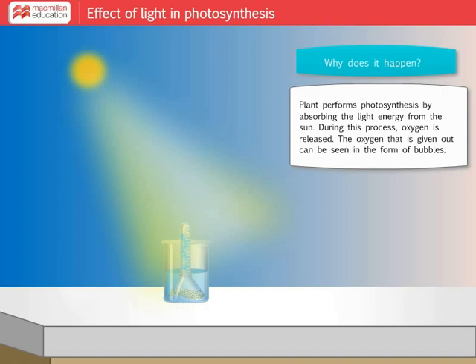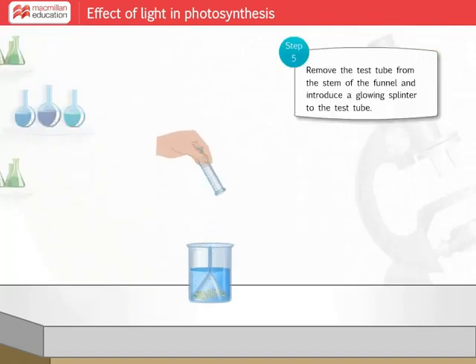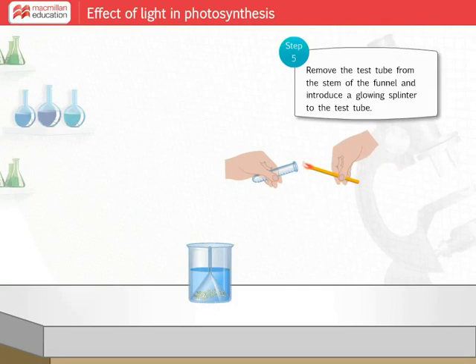Now remove the test tube from the stem of the funnel and introduce a glowing splinter to the test tube.